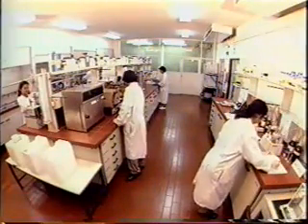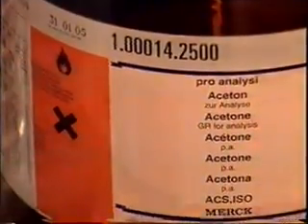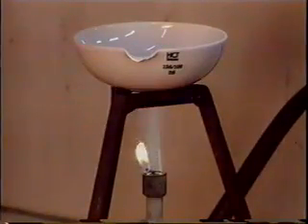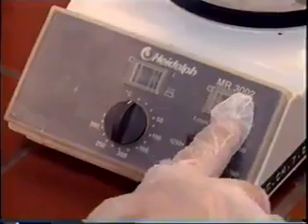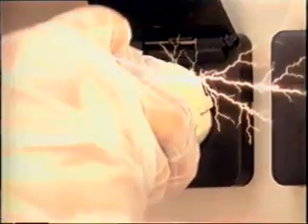Fire hazards. There are several possible sources for a laboratory fire. The most probable sources are flammable liquids. Flammable and highly flammable liquid can easily be ignited when there is a source of ignition, like an open flame, or sparks, or heat sources, and even electrostatic charges. Sparks may also occur when you plug in electrical devices or turn electrical devices on or off.